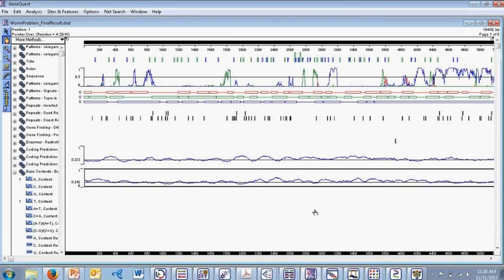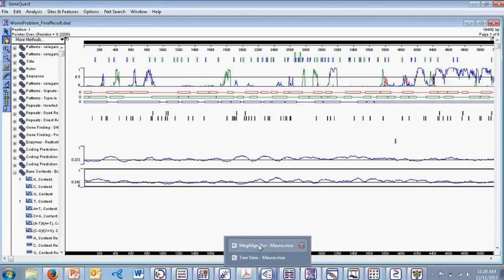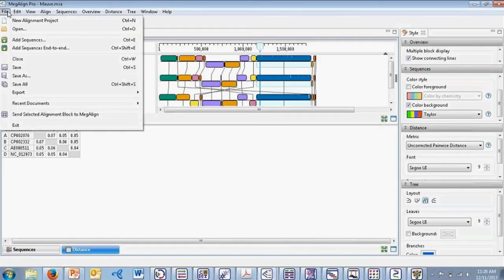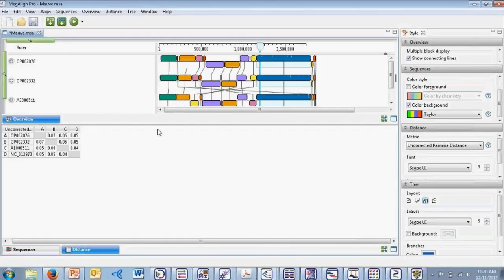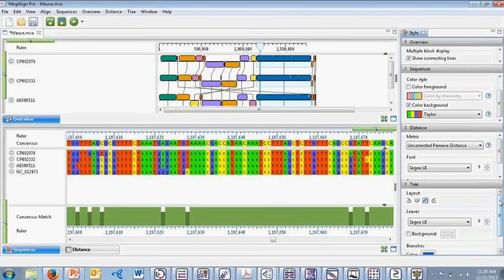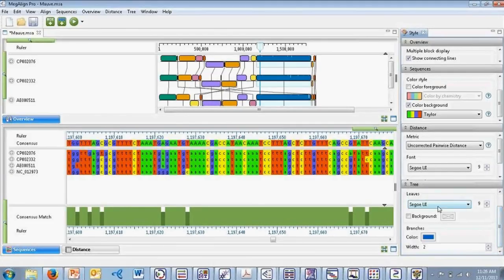We had a question about how to get images out of Megaline Pro — specifically phylogenies for publication. Anything within Megaline Pro can be exported and integrated with our other applications to create publication-quality graphics. Having the style panel is really nice because if you want to export your tree, you can go ahead and customize many different options for how that tree looks right within Megaline Pro.